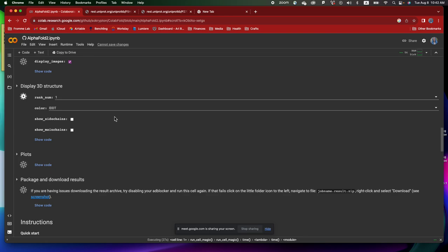So anything from 0.8 to 1 is absolutely excellent, like definitely is a complex in vivo, a very good prediction. 0.6 to 0.8 is most likely interacts in vivo and is modeling what it looks like in a cell, but is less certain. 0.4 to 0.6 may or may not interact.